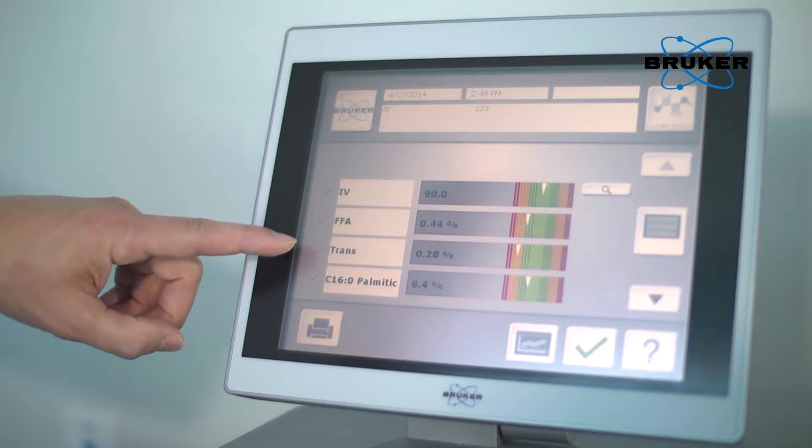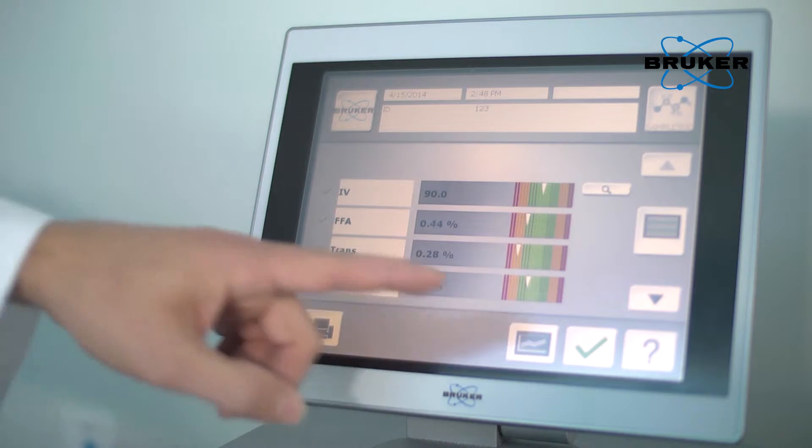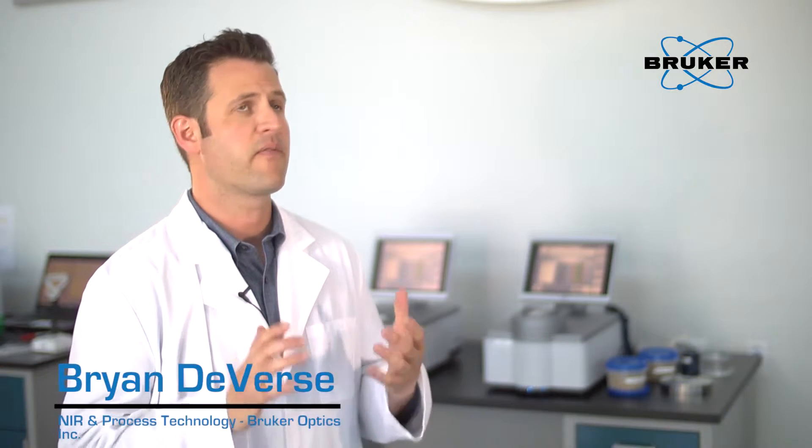The result view shows the quality of the analyzed product immediately. One last push of a button, if required, the stored result can be exported by USB at any time.